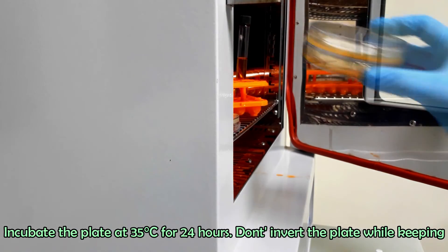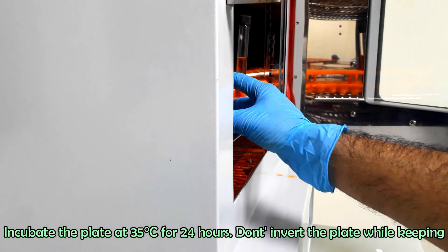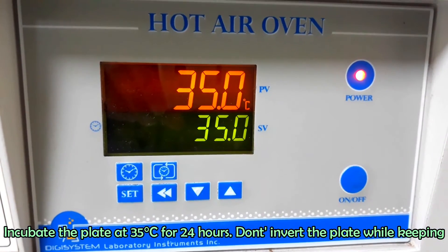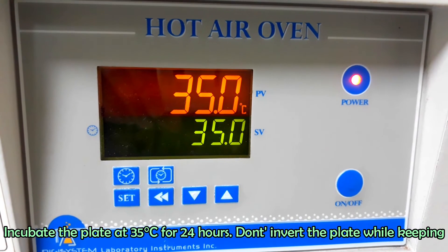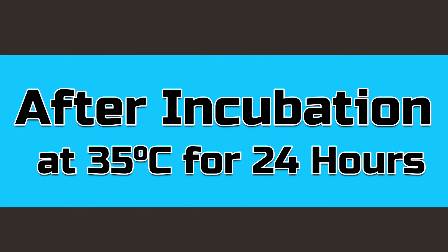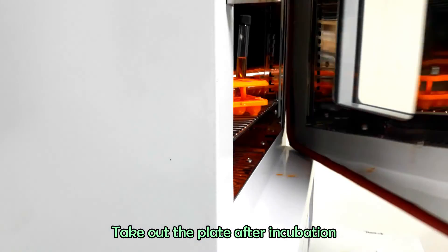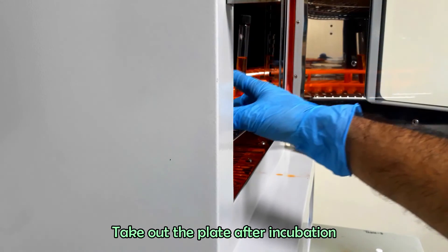Incubate the plate at 35 degrees Celsius for 24 hours. Do not invert the plate while keeping it inside the incubator. Take out the plate after incubation.